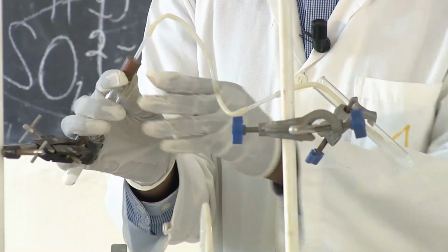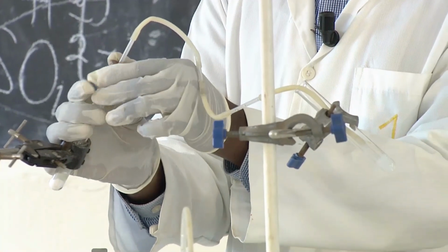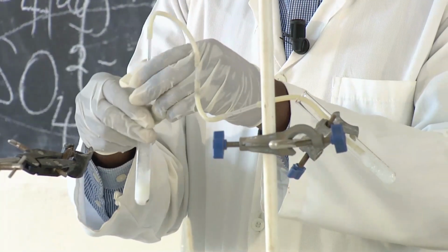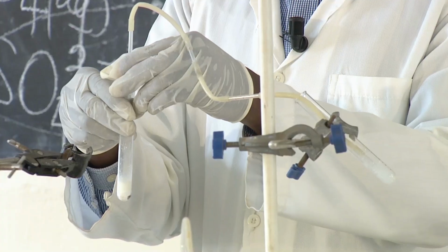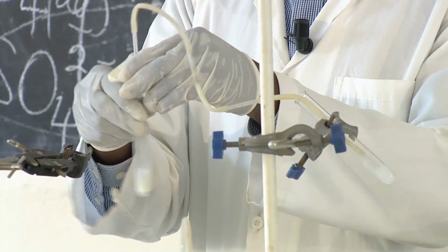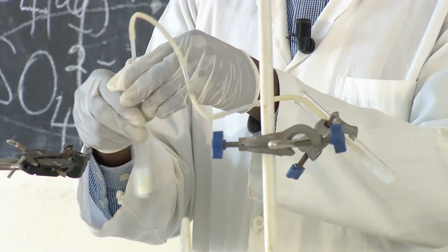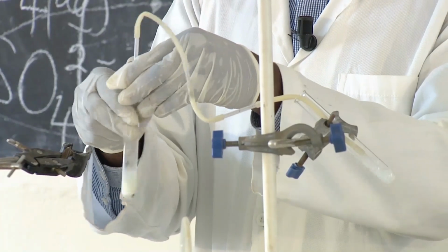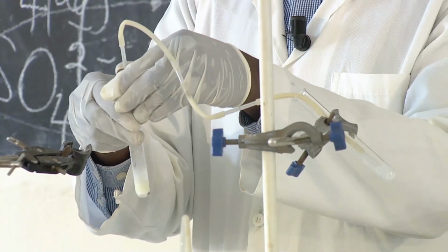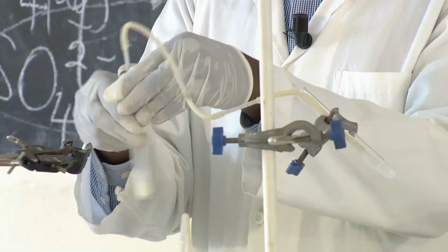You have to make sure the gas doesn't disappear. So the gas is still coming. You see, when I shake, more gas comes out. So that means I'm increasing the rate of the reaction.